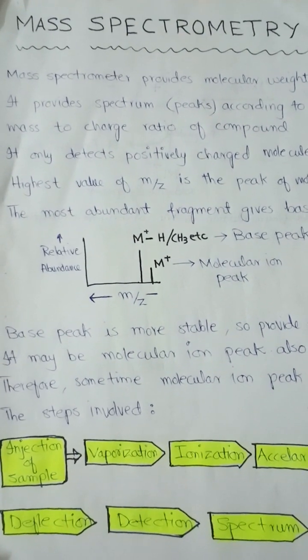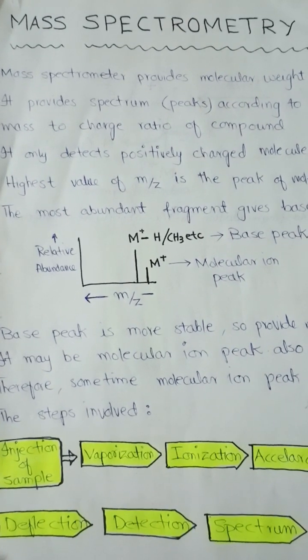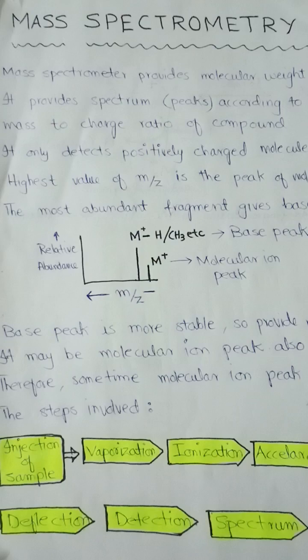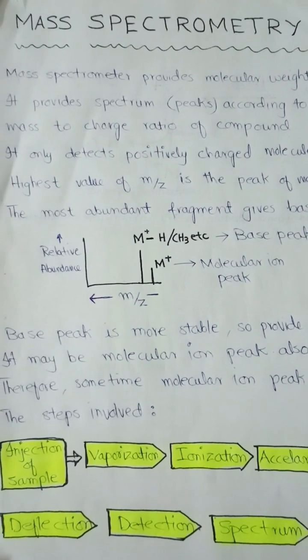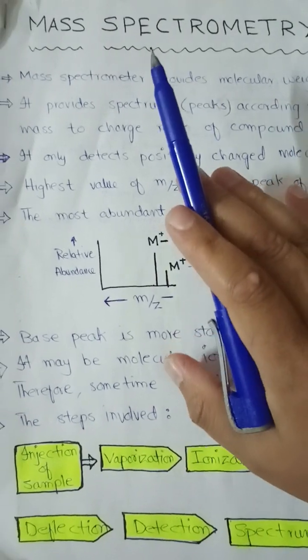So today we are going to discuss what is mass spectrometry, its introduction, its working, and the different conditions that we use during mass spectrometry.